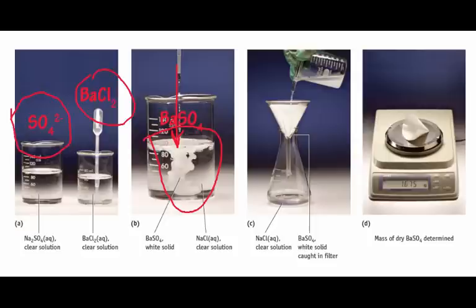To do our analysis, what we'll do is collect all of that barium sulfate that's in our beaker. We'll collect it by pouring it through a paper conical filter, and that catches all of the barium sulfate.